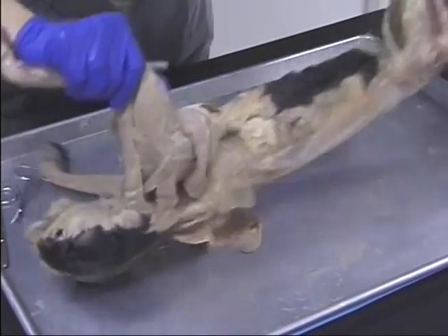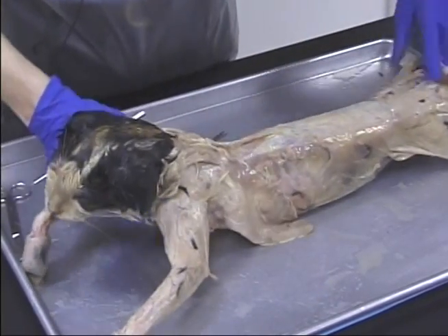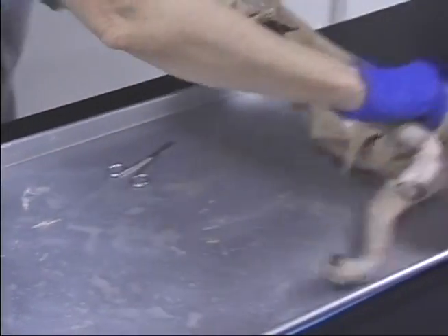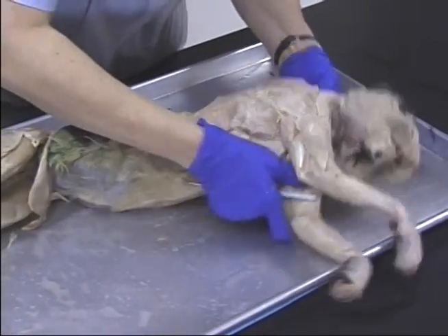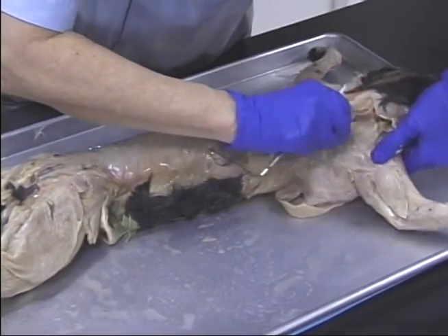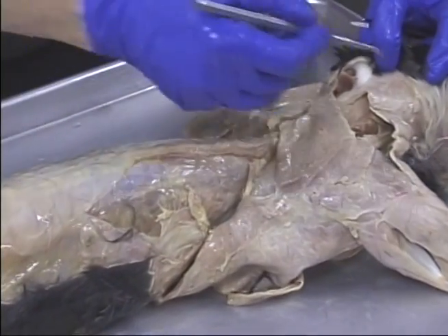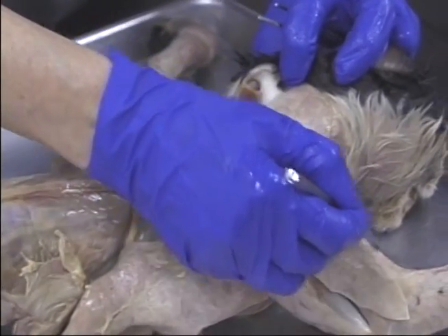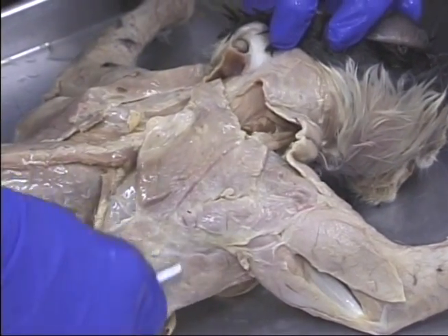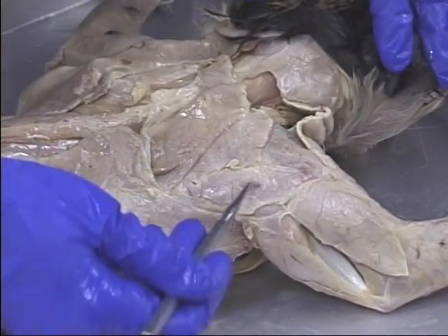Let's turn over to the other side. When we turn over and turn it around so you can see better, we can see here we have the clavotrapezius, here we have the clavodeltoid, here we have the acromiotrapezius, acromiodeltoid, here we have the spinotrapezius, and there's your spinodeltoid.